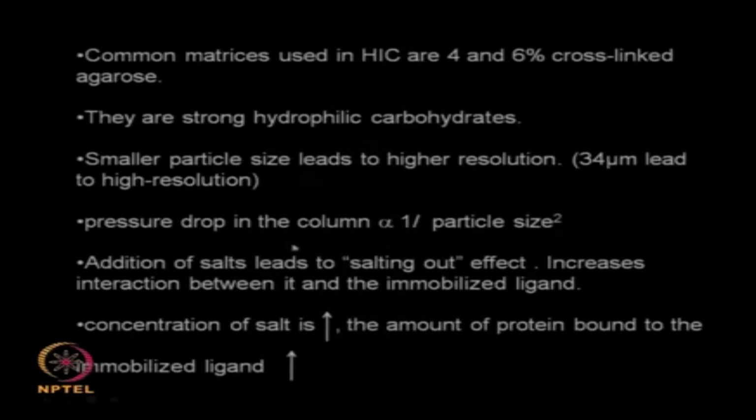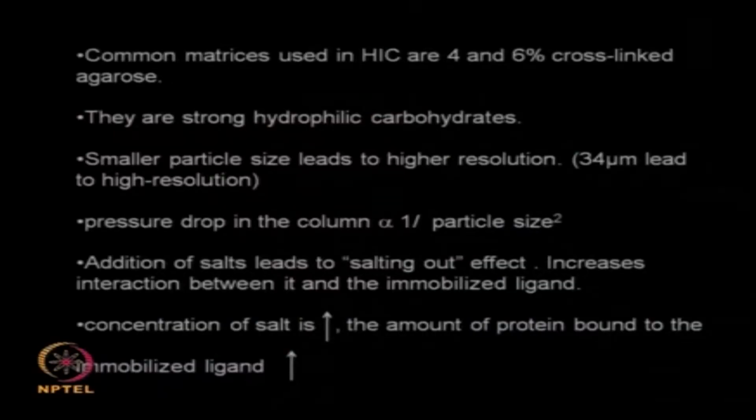Addition of salts leads to salting out. We talked about salting out long time back. So the more salts you have in the solution, protein will start coming out, and it will increase the interaction between the protein and the ligand, okay. So the idea is to increase the interaction between the protein and ligand. So what you do, you can add a lot of salt. If the concentration of salt is increased, the amount of protein bound to the immobilized ligand also increases. It is obvious, when I am adding more salt, I am enhancing salting out, so the proteins are going to precipitate out. Now these proteins will interact more strongly with the ligand.